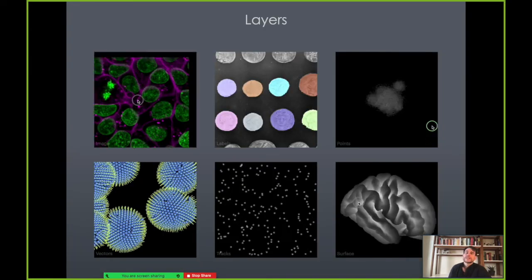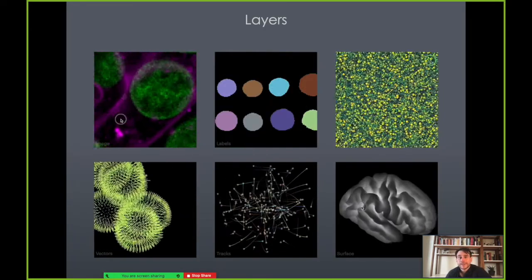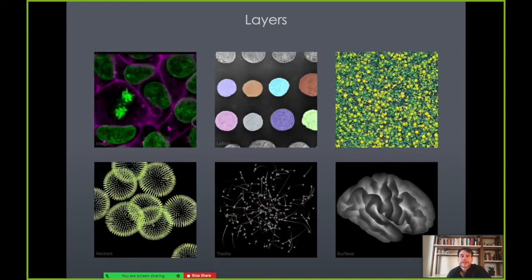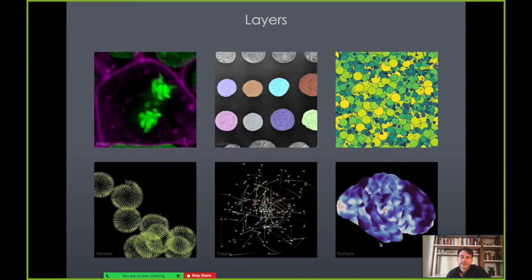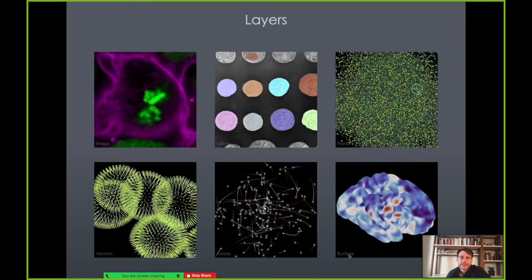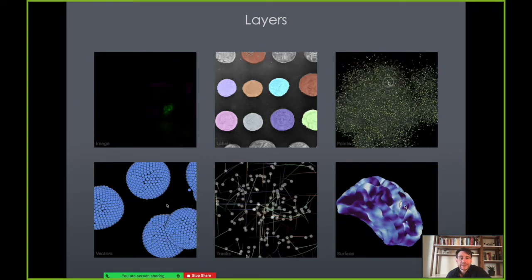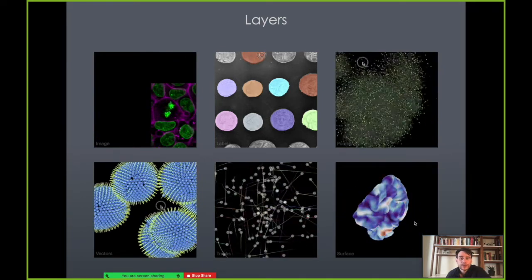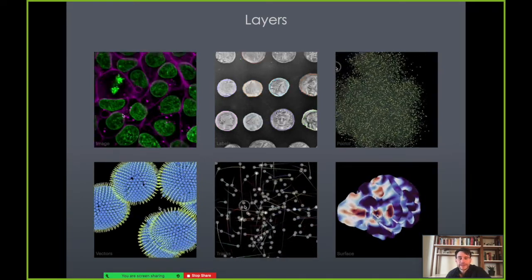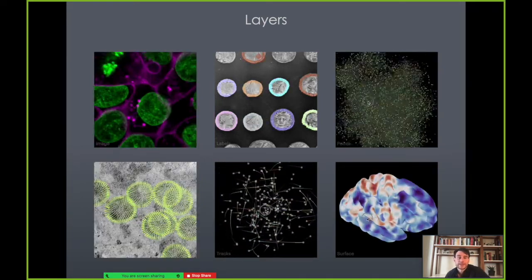Layers are a really fundamental concept in Napari. We've got about six or seven different types: image, labels, points, vectors, tracks, surface, and shapes.